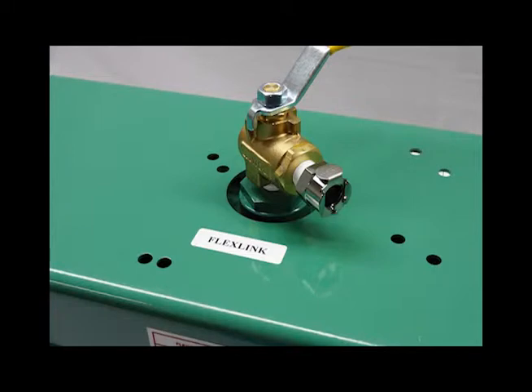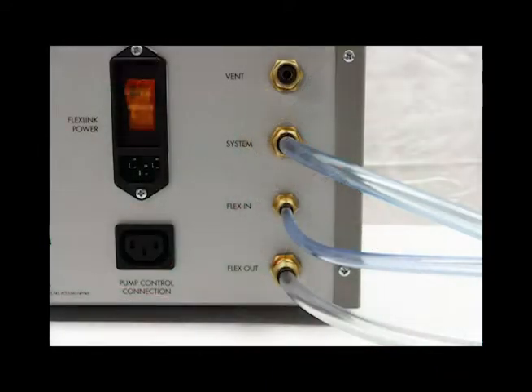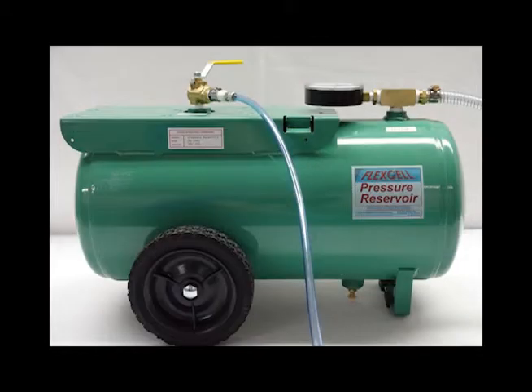Using the supplied quick disconnect, connect one end of the blue 3/8 inch or 9.5 mm tubing to the flex link port on the pressure reservoir and the other end to the system port on the back of the flex link box. The pressure reservoir is now connected to the flex link.